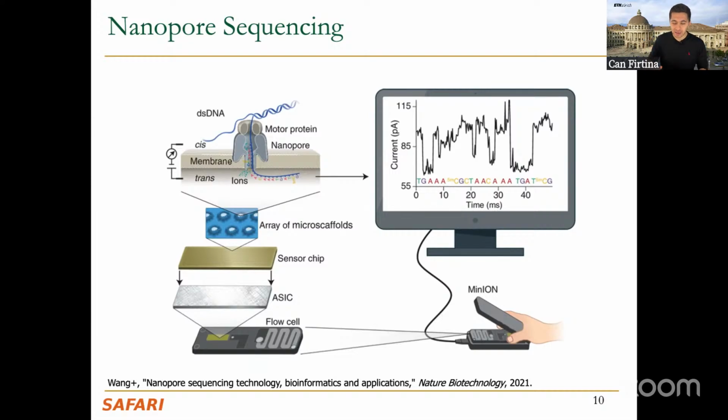Although there's still a speed variance, the speed is now in a more controllable fashion, usually around 400 to 500 nucleotides per second. And since we have sufficient technology now, we can take 5,000 electrical samples per second. This means that we can take 10 samples per base.